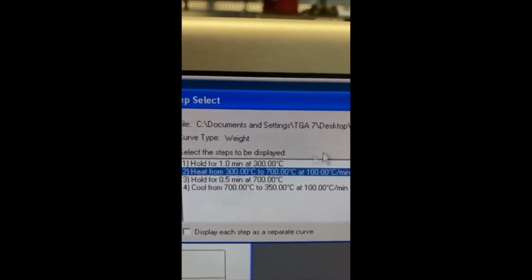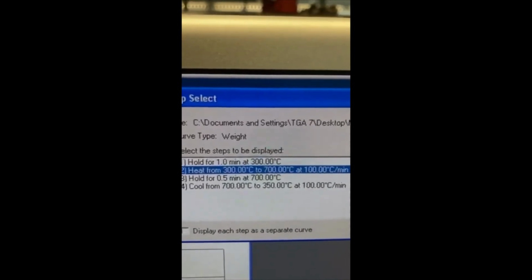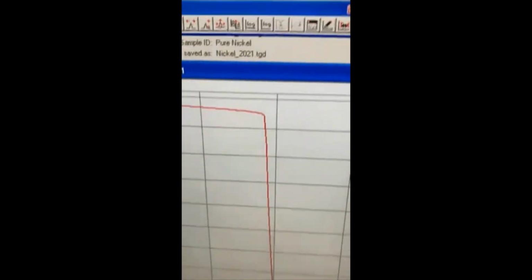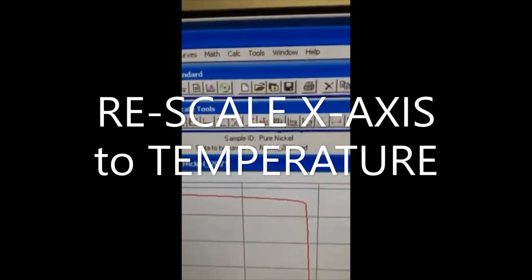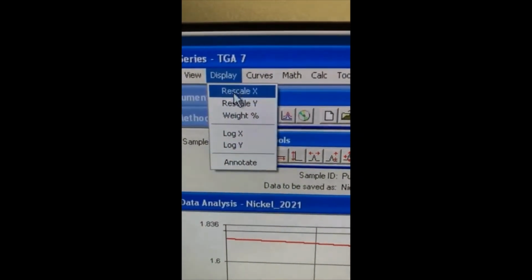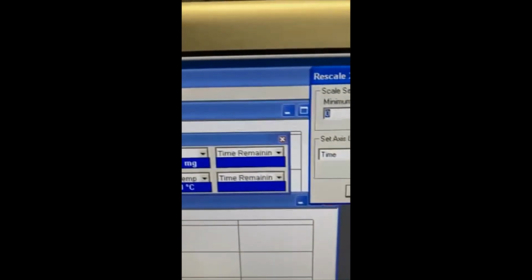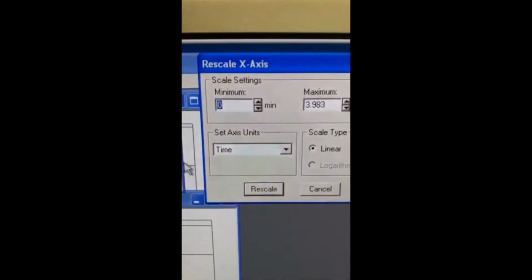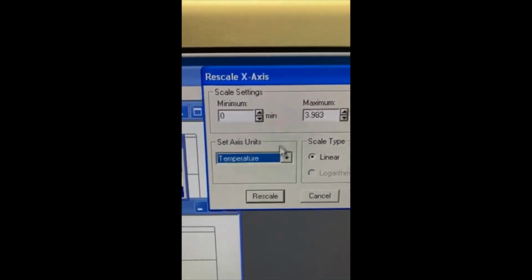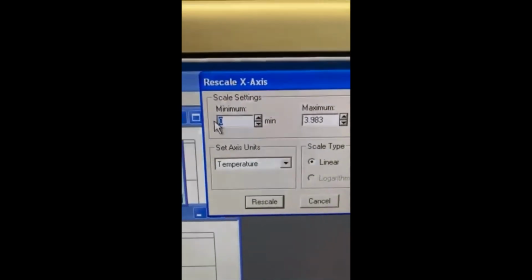Both the y-axis and the x-axis can be rescaled to allow more detailed inspection and assessment of the phase transition and the associated Curie temperature. Your plot should be sample weight on the y-axis and sample temperature, not time, on the x-axis. We are trying to assess the Curie temperature, so the sample temperature needs to be one of the two axes. In this case, it is the x-axis.